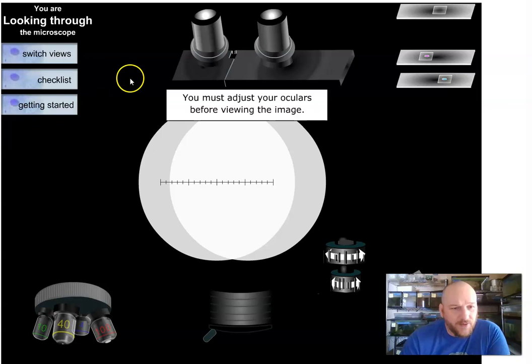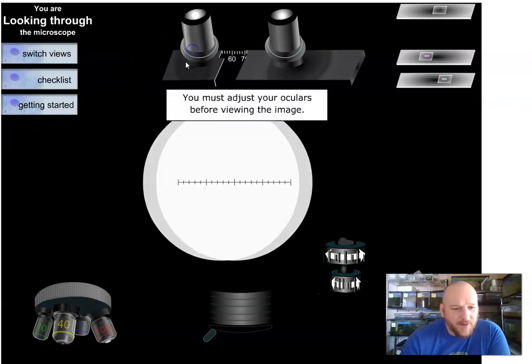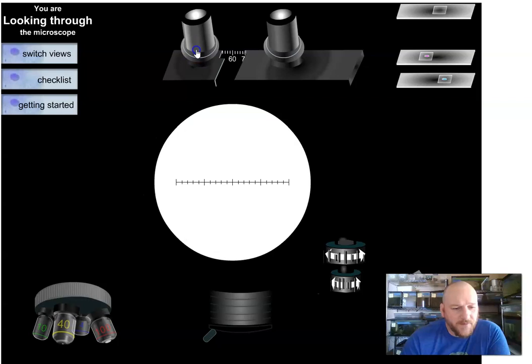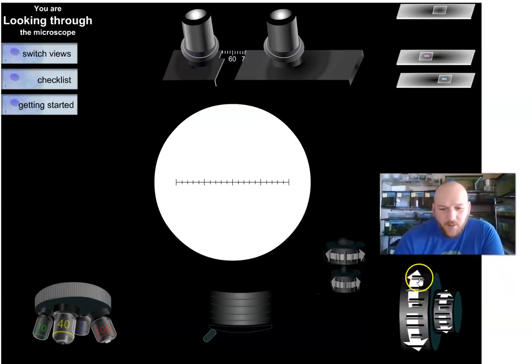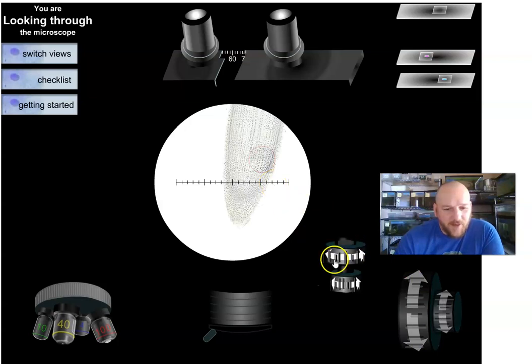We have to adjust the oculars here so we'll bring them apart to bring the image together. A little too far. Bring our image together and then from here, I'll move out of the way, we need to focus our scope. So we'll click on the button here to see if we get an image into focus. It's like nothing there, let's go the other direction. Ah there it was and there we have our onion root.